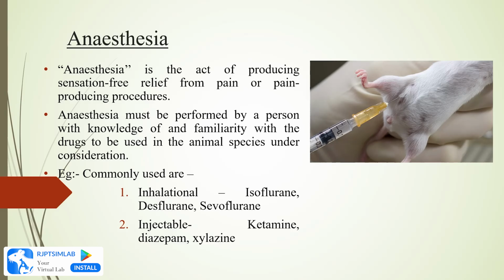Anesthesia. Anesthesia is the act of producing sensation-free relief from pain or pain-producing procedures. The statement says that it is an act or a procedure of producing sensation-free relief from pain or pain-producing procedures, which means after the effect of anesthesia, the animal becomes unconscious.